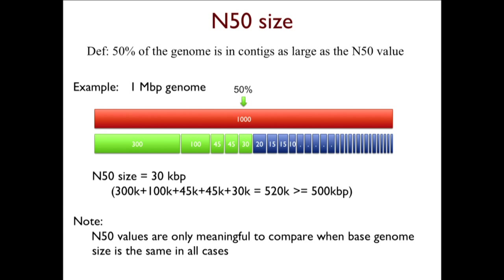A much more common scenario is you're going to have some very big contigs, which I'm showing over here, and some very little contigs, which I'm showing down here. That's a much more typical representation of what you have. So you can imagine, given this size distribution, lots of different ways that you might try to summarize this. You might take the mean or the median or whatnot. A lot of that's going to get dominated by this long tail of tiny little pieces.